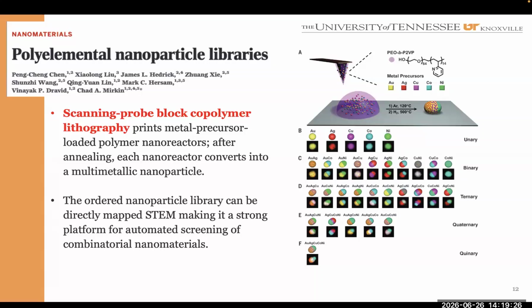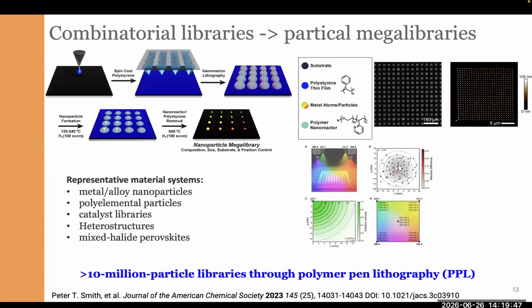And they showed in this specific article how you can do it on a substrate. Probably it was, don't let me wrong, just a TEM grid. So on a substrate suitable for scanning transmission electron microscopy.